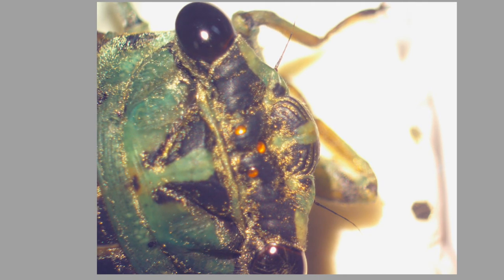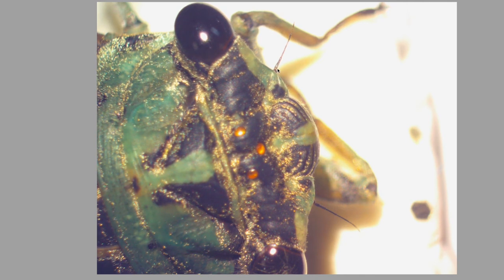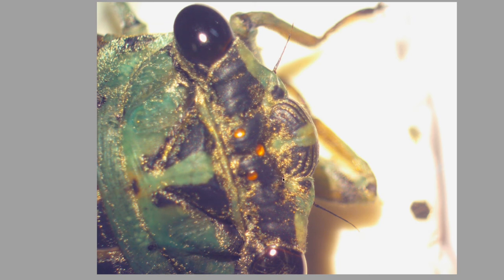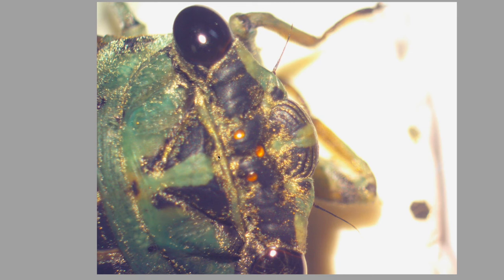So see, we're at 7X. So see, here's the whiskers. Well, they're not whiskers, the antennae, whatever they're called. Anyway, you actually see this line come right up here, and then there's a circle right here. And then this would come back off this way. So that would connect into this circle here. So that's, I think, where it would start. Like, they would start to push out through this. And then you have this seam coming along the back.